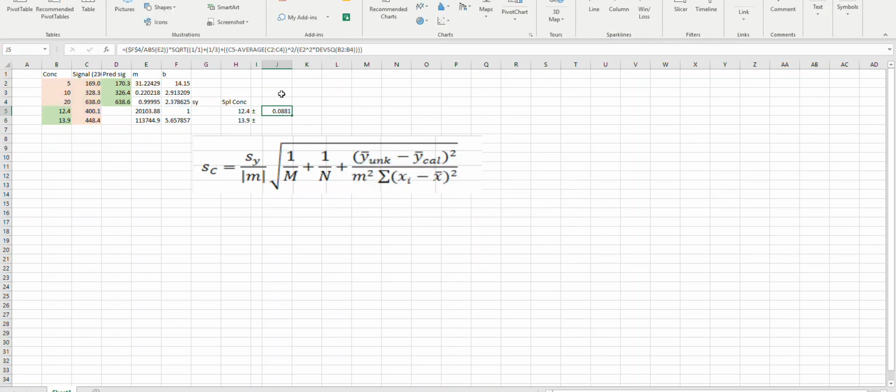So I think that worked. It gave me an error. I think it made a correction earlier on, but I'm quite sure this is correct. There's the first term. There's the second term. There's the grouping on the second term. Yep. Oops. I think we have a mistake here. No, we don't. We're good. Let's see here.